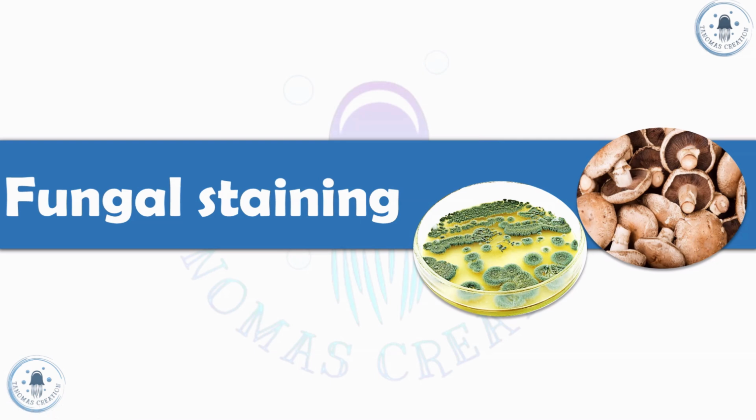Hello everyone. Today we are going to learn about fungal staining. In this picture you can see this is a type of fungus. This is one of the fungi grown on the plate, and this is the mushrooms. All these types of fungus we are going to learn how to identify using the staining method.